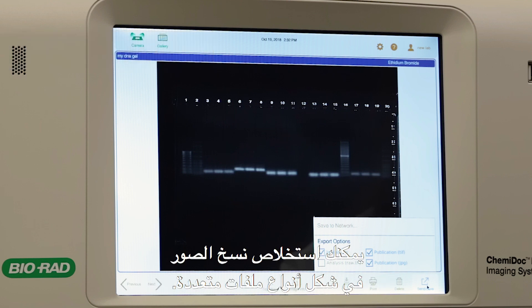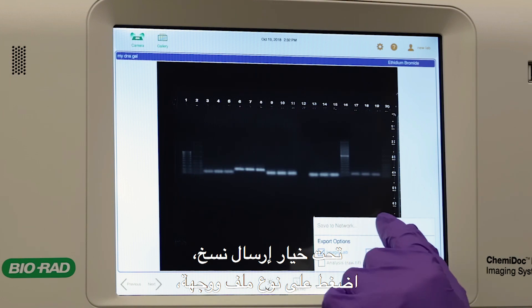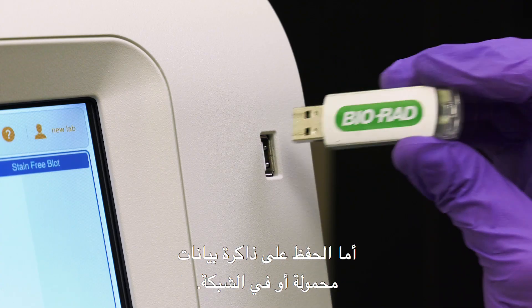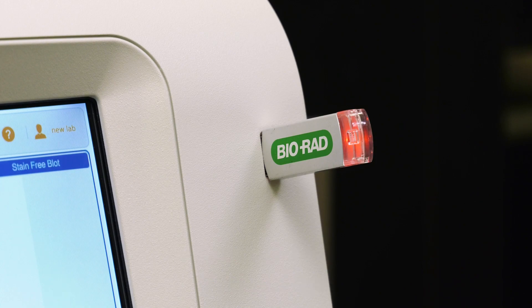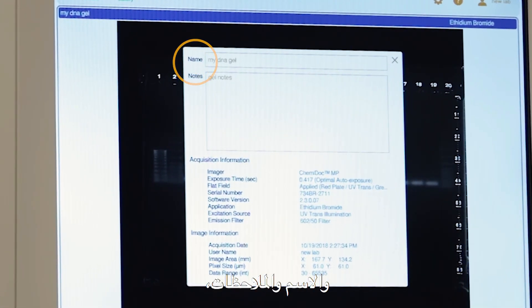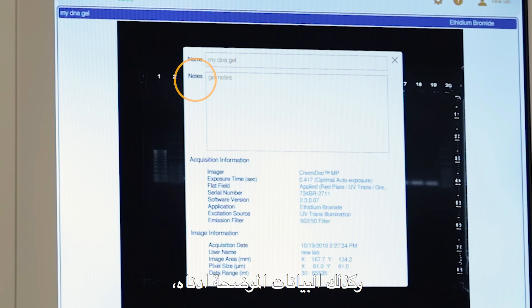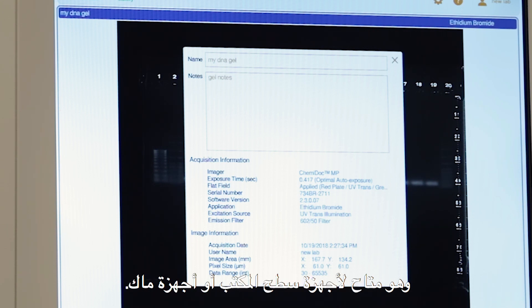Tap the send save icon to select the file format. You may export images in multiple file types. Under export options, tap a file type and the destination, either saving to a USB drive or to a network. When you choose the image lab file format, your custom name and notes, as well as all the data indicated, are exported to Bio-Rad's license-free Image Lab analysis software, which is available for both Mac and PC.